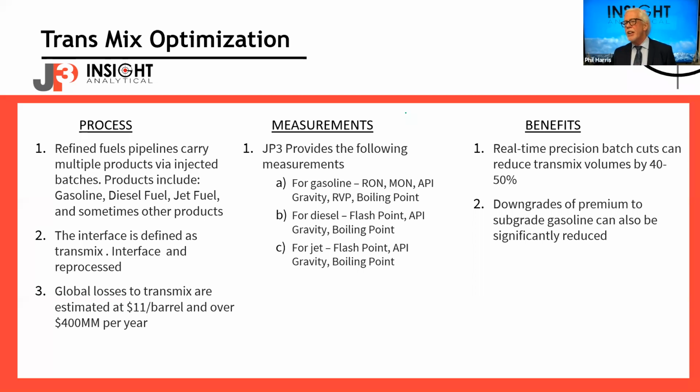So on the liquid side, on liquids composition, you'll certainly see liquid inject GCs for doing chemical composition. This is one of the big applications that's coming up here.